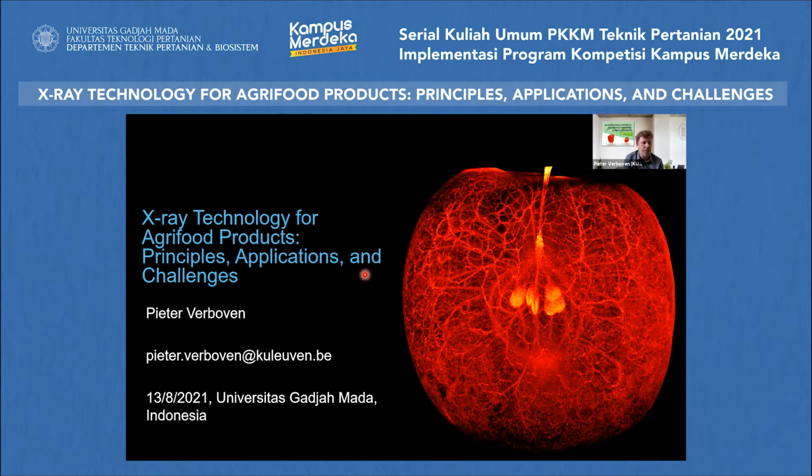And in the next part of the presentation, I will try to show you how X-ray technology helps us do that.